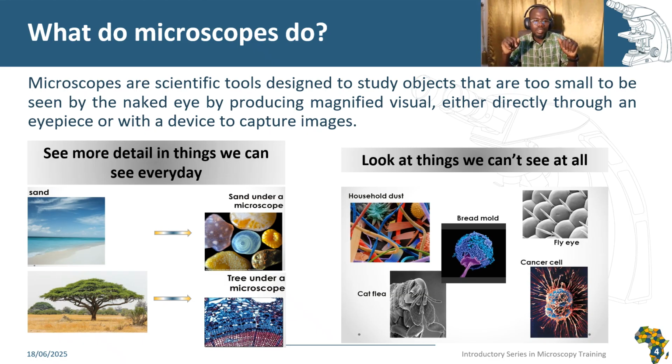for image analysis. With the microscope, you can magnify objects that reveal some interesting microstructures that help you to study more details about that specific object. For example, looking at the sand under the microscope, where individual grains appear like a small stone, each with different colors and shape.